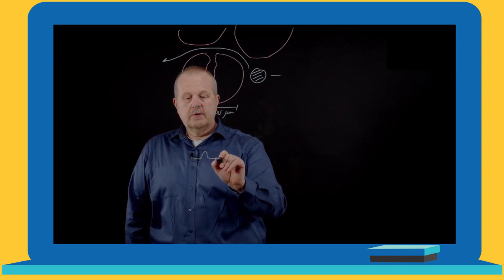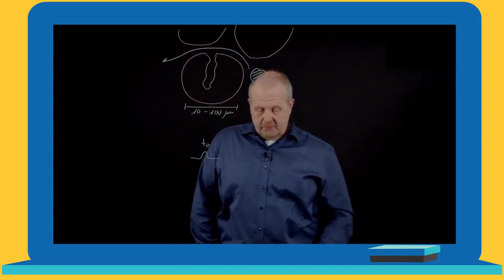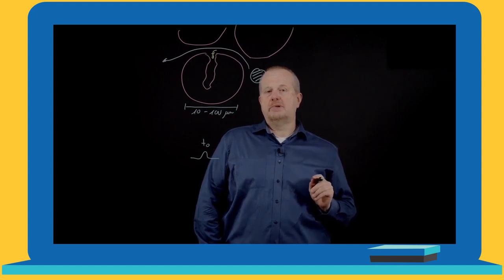So then we have something which elutes here with t0, the column dead time we already learned about in the first part of our video. The smaller compounds to be separated will also be transported by convection, by the flow which our pump is delivering, but they are able to penetrate into our pore system. And here something very important happens.